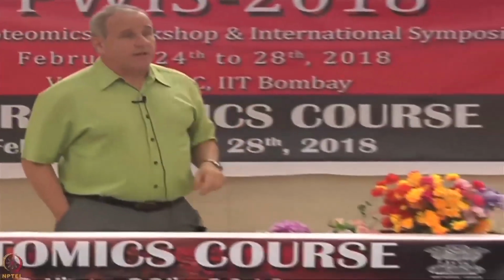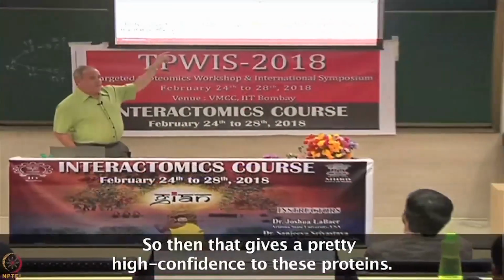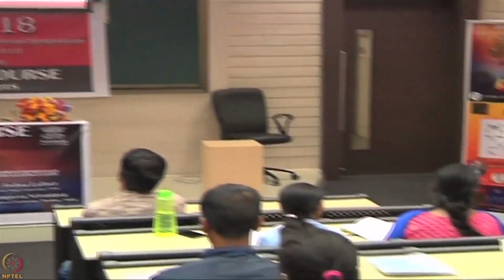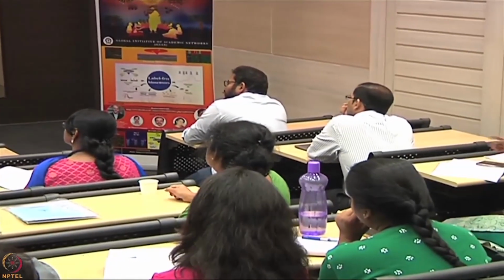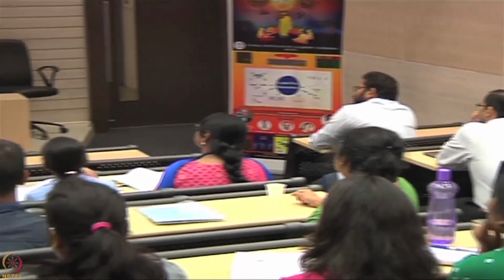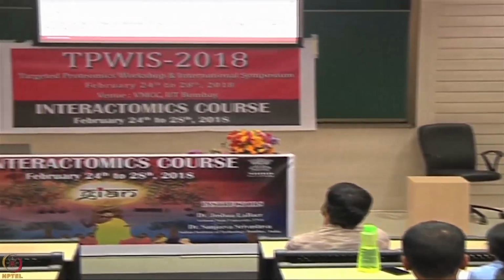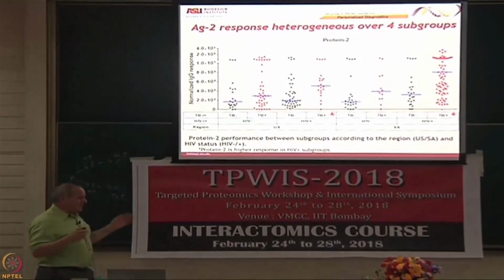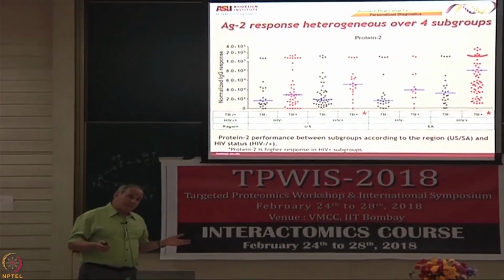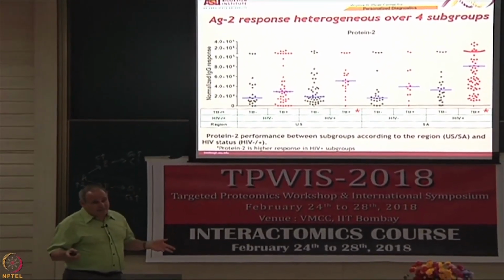All 40 were tested with ELISA. Yeah, and these results are ELISA results. We're pretty highly confident with these. But if you look at the sensitivity, the sensitivity here is not outrageous, because there are TB negatives that have signal. Now, as you know, this is challenging because what we call a TB negative patient might not be a TB negative patient.